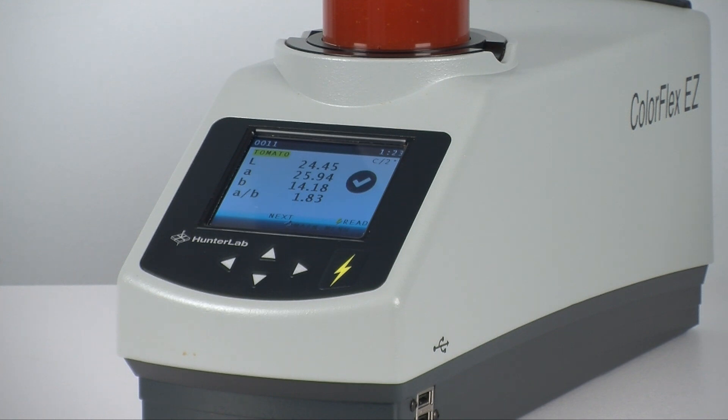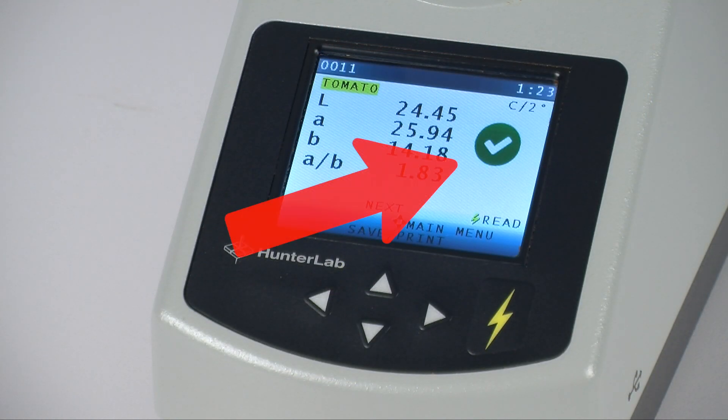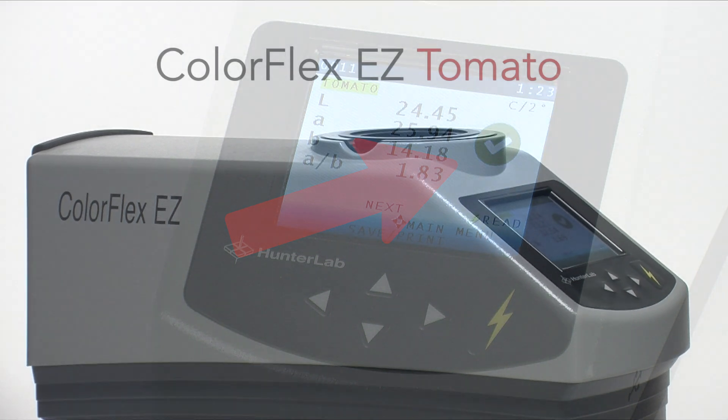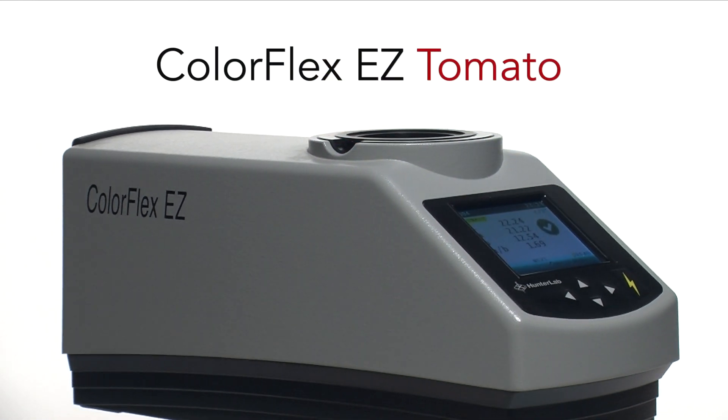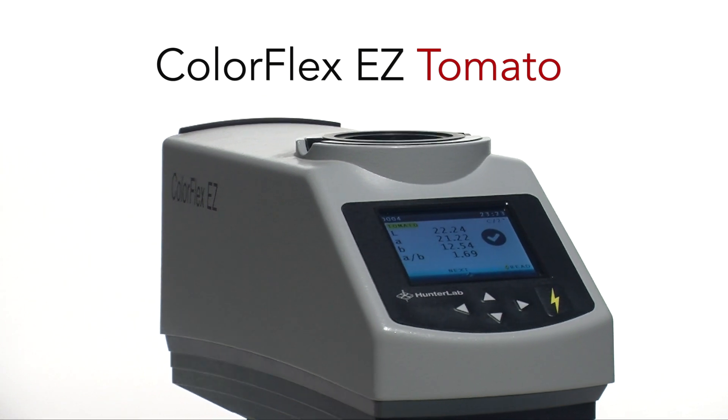Further simplifying the task of evaluating your tomato product is a visual pass or fail mark. It indicates whether that sample is within the established, acceptable color range your company has set for quality product. The ColorFlex EZ Tomato gives you the most efficient process for measuring the color of tomato sauce in the industry.